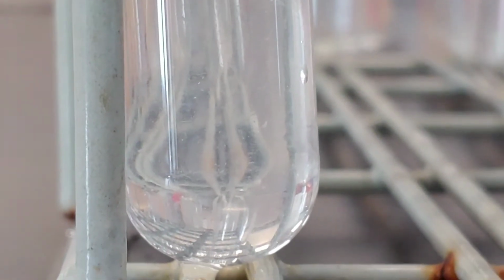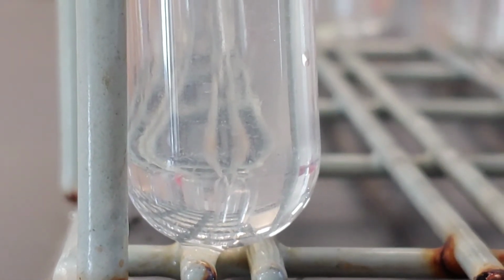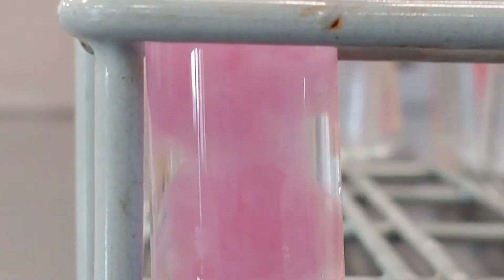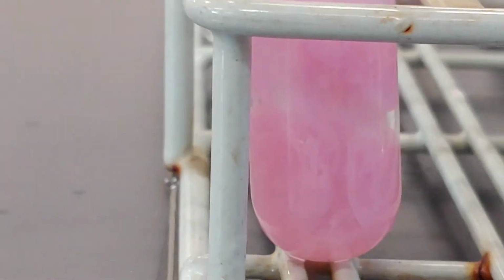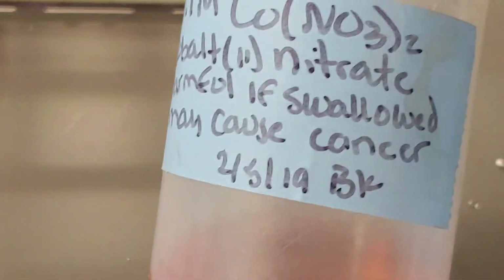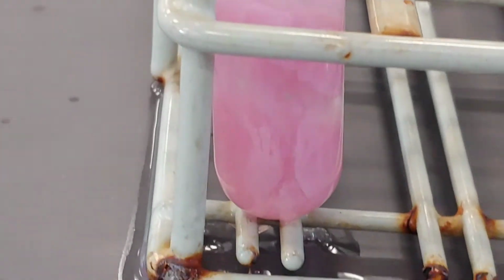Okay, reaction number 10. Aqueous sodium carbonate, not baking soda, sodium carbonate dissolved in water, and to that I'm going to add cobalt-2 nitrate. Looks like cotton candy. It does not taste like cotton candy. Guarantee you that because the cobalt nitrate label says harmful if swallowed, may cause cancer. Yes, harmful indeed. There is my sodium carbonate plus my cobalt-2 nitrate.